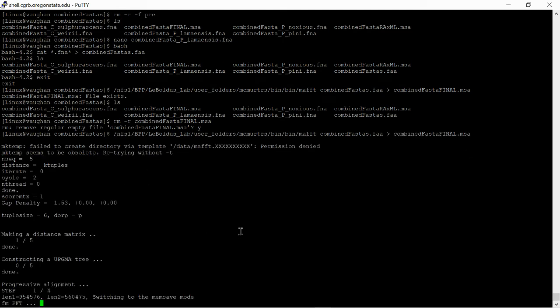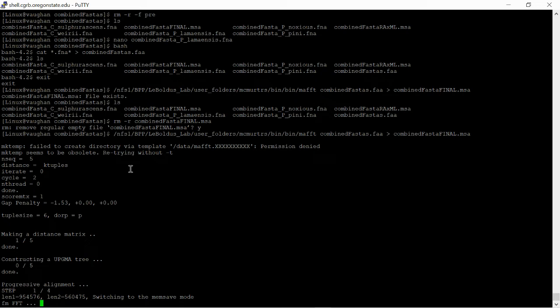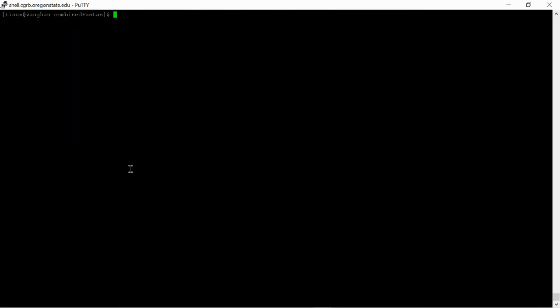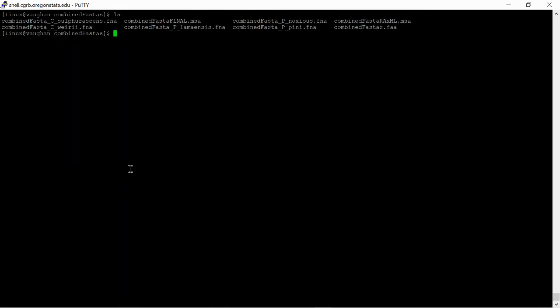Okay, so we can see that it's running, and I'm going to go ahead and kill this job. It does take quite a while to run, so you're probably going to have to submit it as a job. But regardless, there's how you do that step.